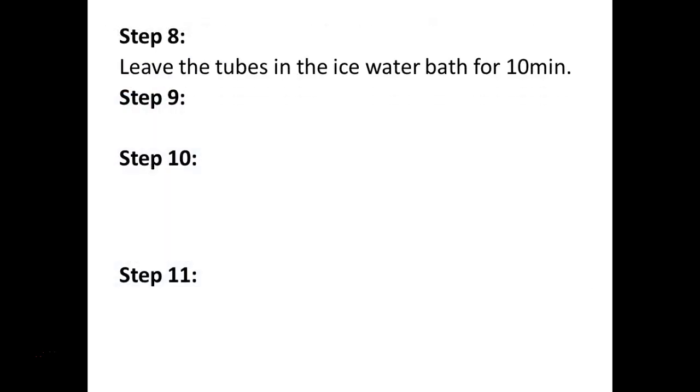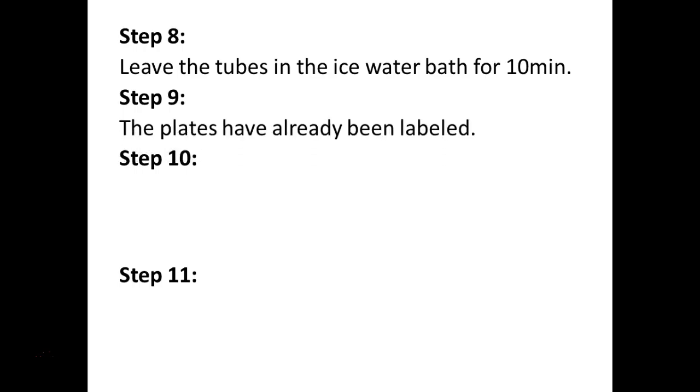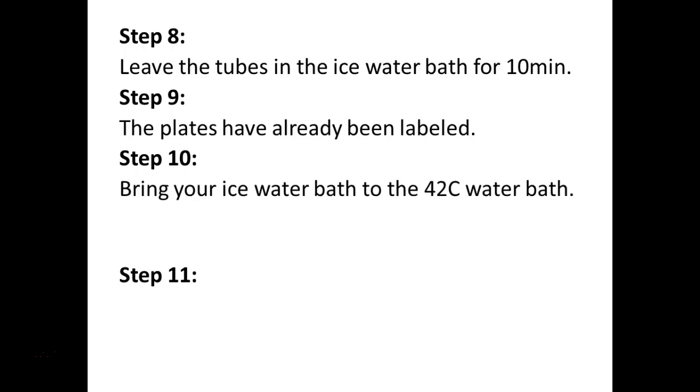So, we're going to leave the tubes in ice for 10 minutes. The plates have already been labeled, as you see. Each one of those plates is different, and because of that, it's easier for me to label them before I give them to you. Otherwise, you would potentially mix them up. Although our sugar is caramelized, so it turned the color of the plates a little darker.